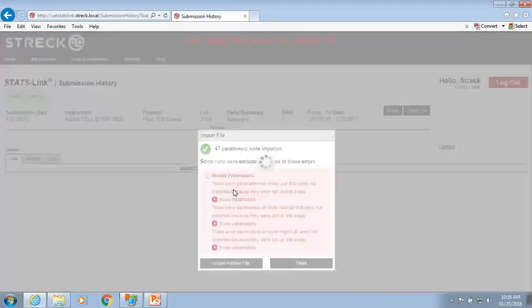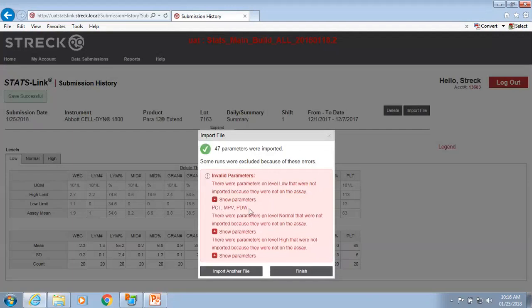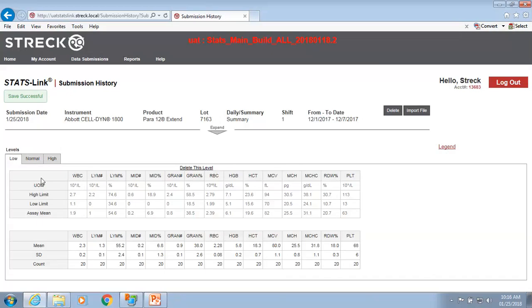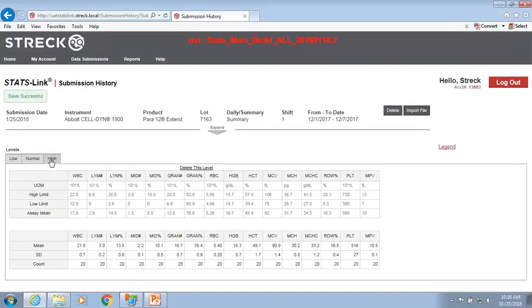And it is populating that. Okay, and we have that same configuration again where there were values set up in the Excel file that were not set up for the assay, just to demonstrate the abilities here. And so the values have been brought in for all 3 levels, and they're being shown here. All right, so that's 2 different examples.